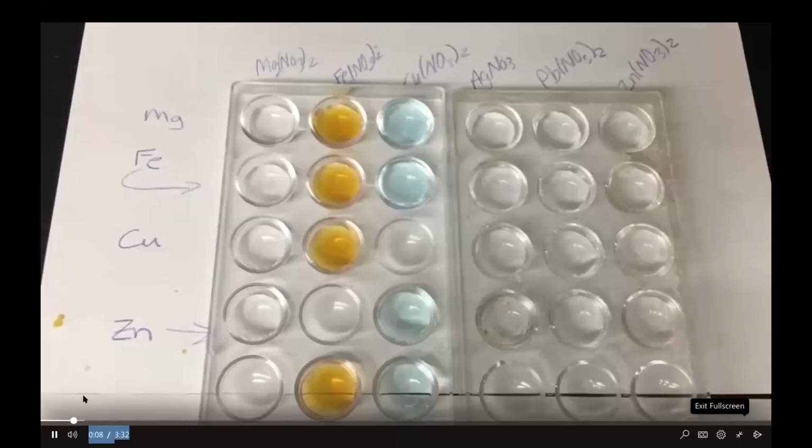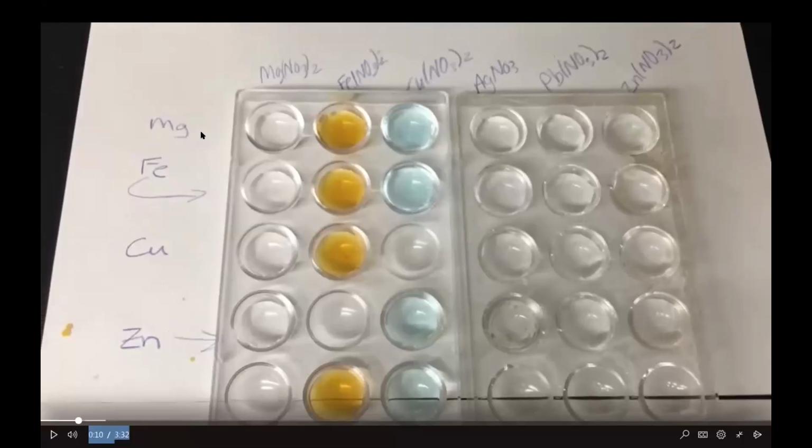So on that chart, we're not putting magnesium and magnesium nitrate. That doesn't make any sense. Instead, magnesium is going to go in with iron nitrate. It's going to go in copper nitrate, silver nitrate, lead nitrate, zinc nitrate.